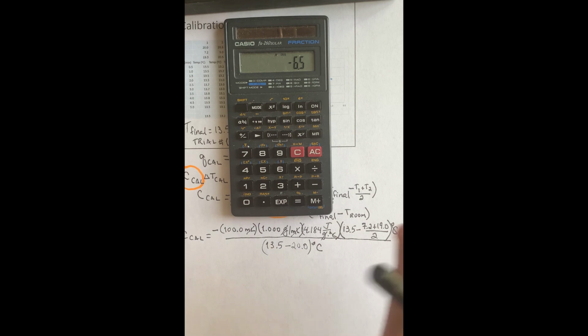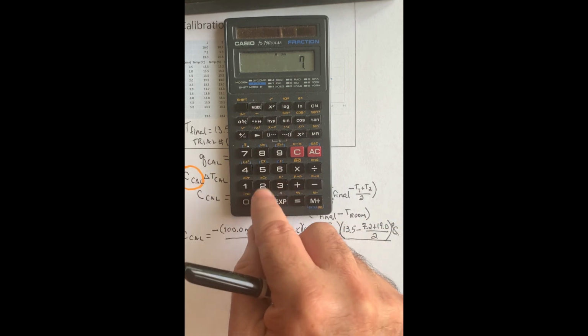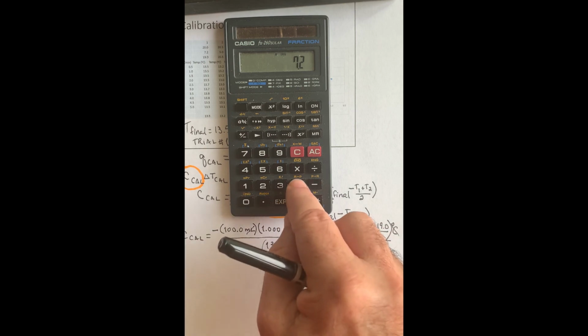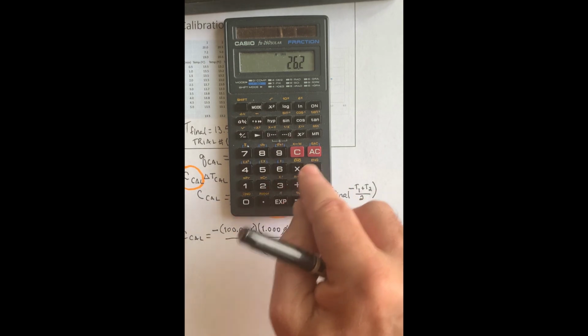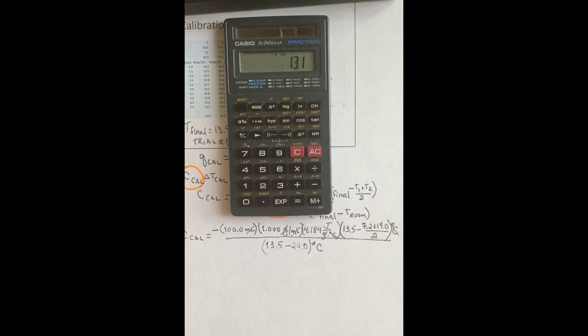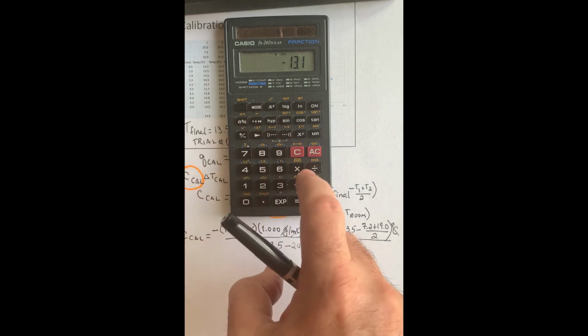All right. So let's go ahead and do the top here. So I have 7.2 plus 19 divided by 2 equals 13.1. And I'm going to subtract that from 13.5.